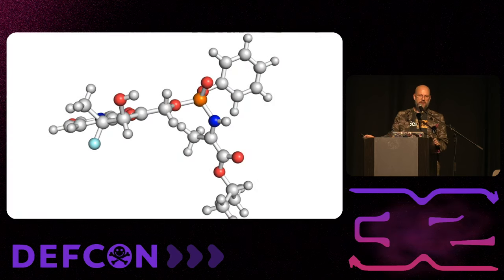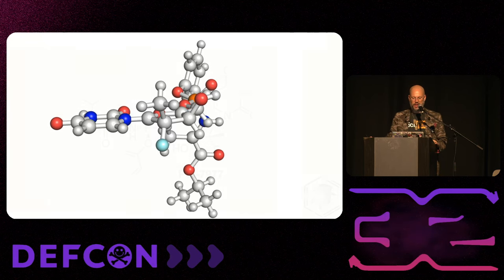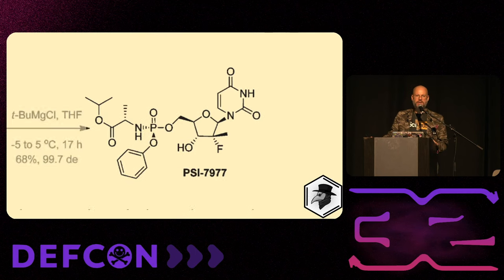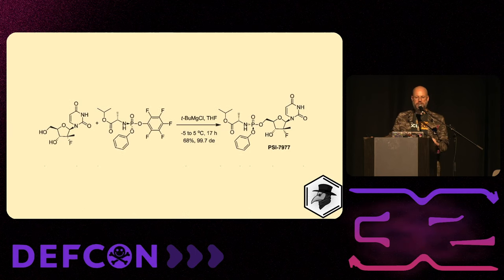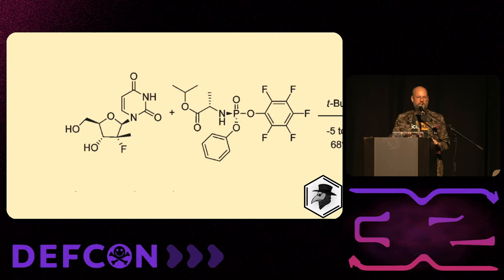This was Sovaldi. This was the molecule that we were talking about yesterday. And just so you guys can see it again, here's what it would look like if you found it in the literature. This is the reaction. Don't get too nervous if chemistry makes you nervous. We're starting one step here. We asked it to do one step, and it showed us a way to do it in one step.